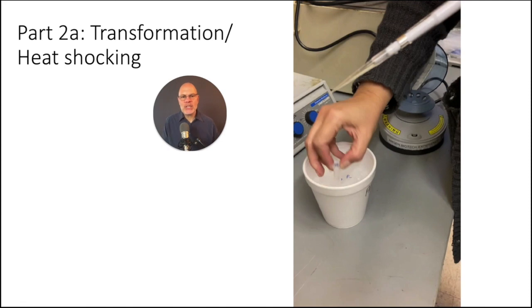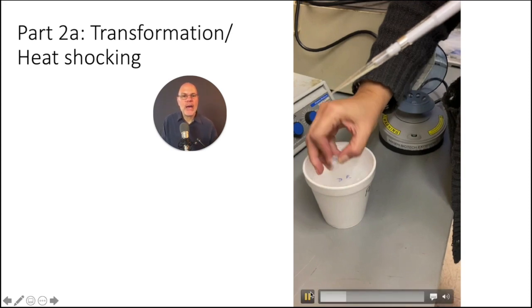We received these competent cells from Amgen. And then what Johanna just did was she fed them. One of these tubes is marked P-, one of them is marked P+, because we're going to put the plasmid in some of these cells. We're not going to put it in other cells. So let's see what happens next.